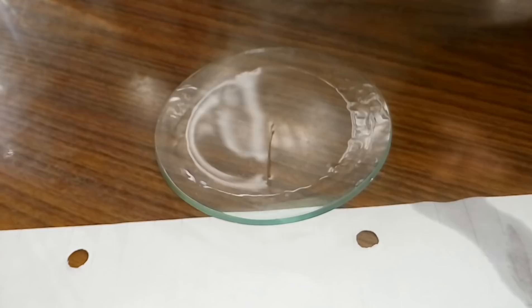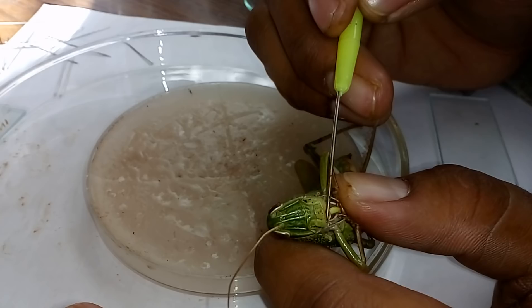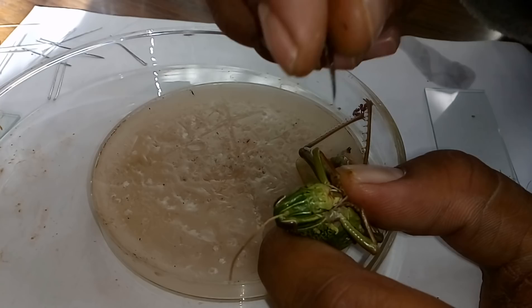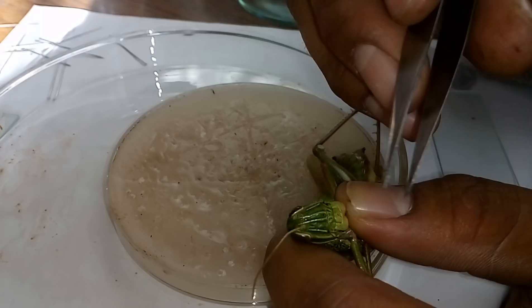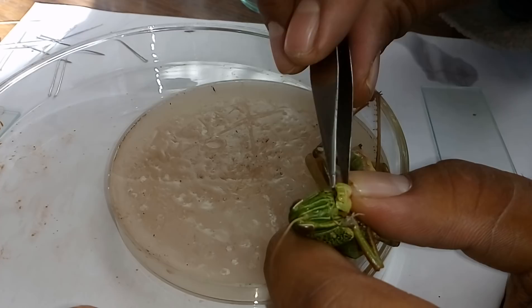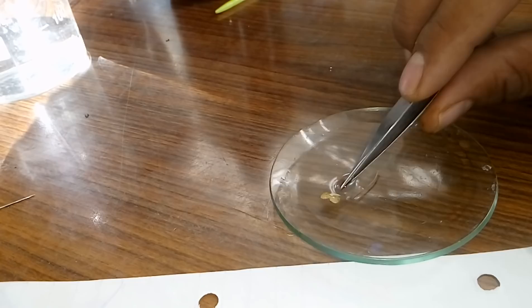Now we have to remove the mouth parts. Look here — this first flat-like structure is the labrum. For the removal of labrum, this is the clypeo-labral suture where it is attached with the clypeus. For removal of the labrum from the clypeus at that suture, we have to slightly cut it using a blade, or we can remove it directly. Using forceps, carefully we just removed it — this one is the labrum of the locust. Now again we put it into 70% alcohol so that we can get good quality slides.